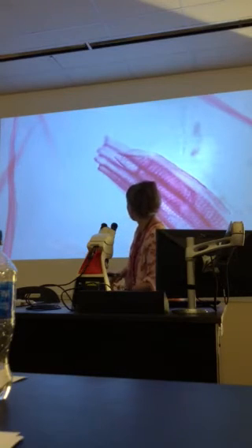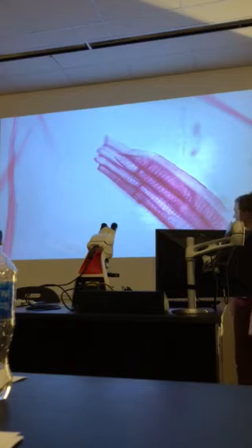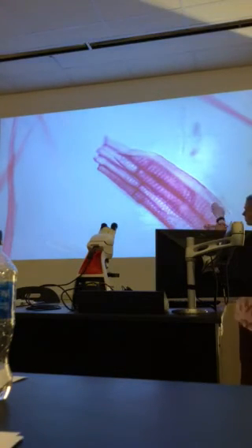Where you can really see those cross hatches. They have lots of them. Those are vessel elements, okay? Those are vessel elements. Wider cross hatches. Those are my vessel elements. Tracheids with the pits are much longer and narrower and have the bigger holes in them.